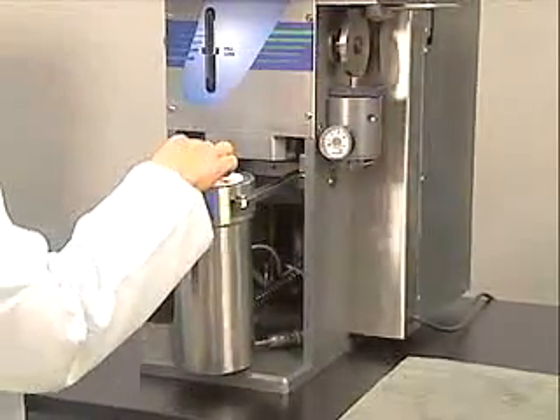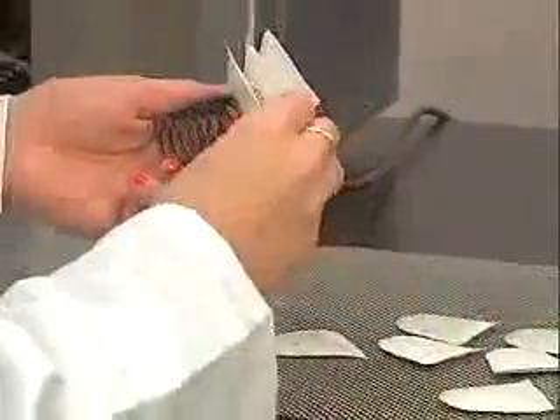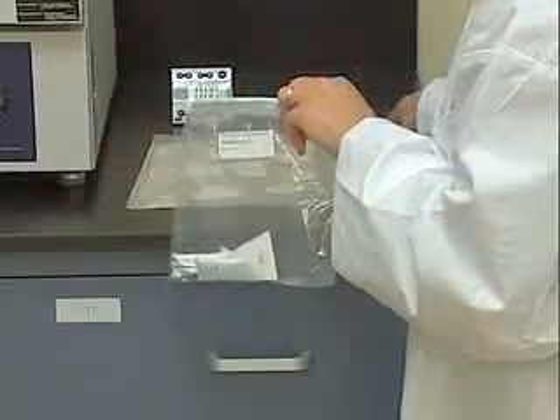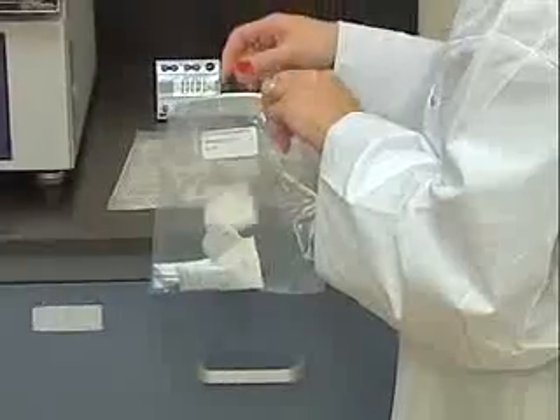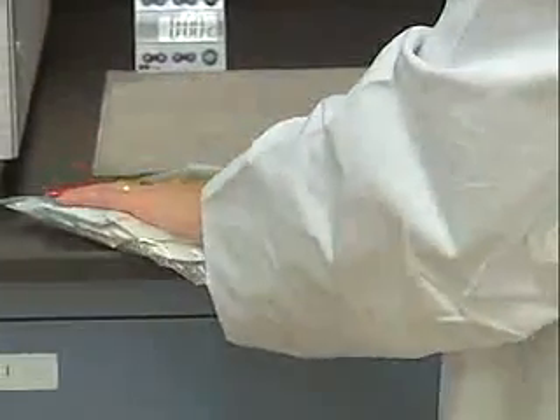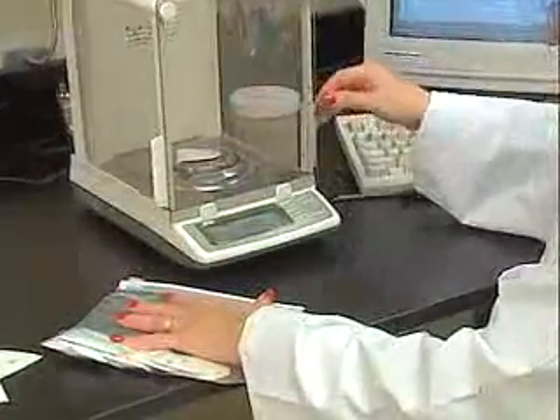You'll get precise and accurate values. When the samples are removed, the technician places them in an oven for a short post dry. The samples are placed directly into a moisture stop whey pouch from the oven, which eliminates moisture gain often caused by air exchange in large desiccant cabinets. The samples are then re-weighed for the final determination of the fat.